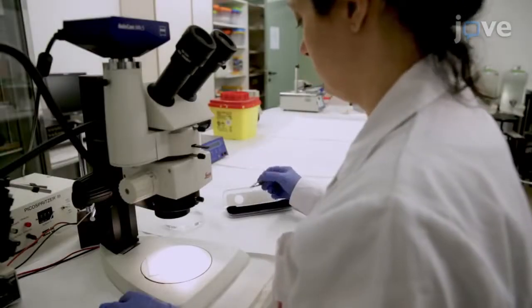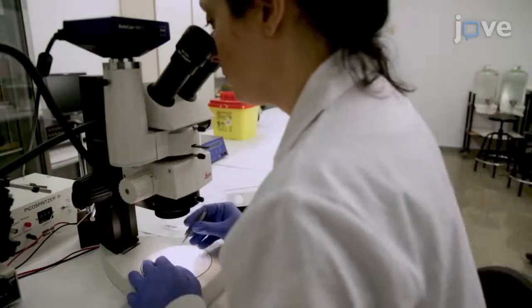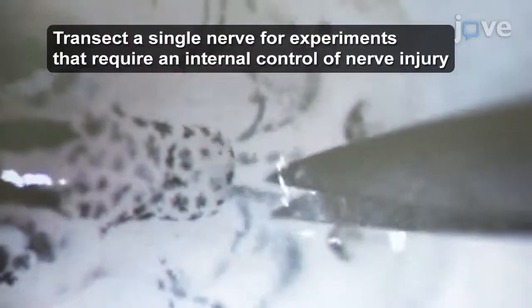For behavioral experiments, use Vanna scissors to transect both nerves to suppress all odorant information arriving to the olfactory bulb.